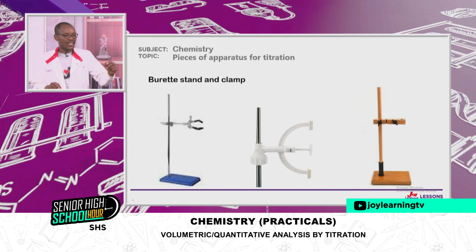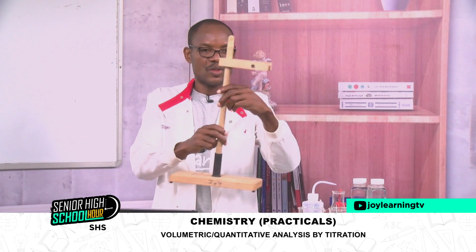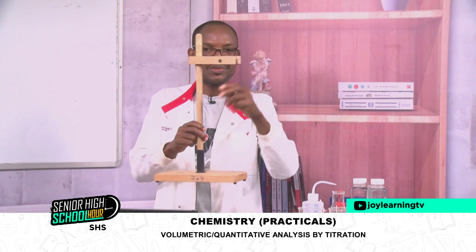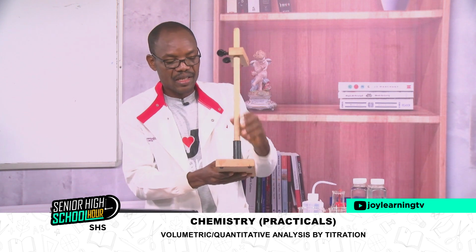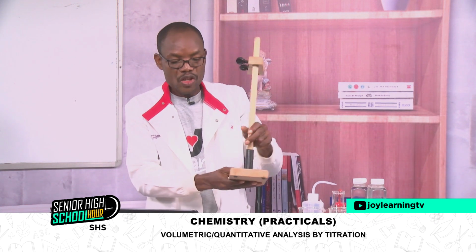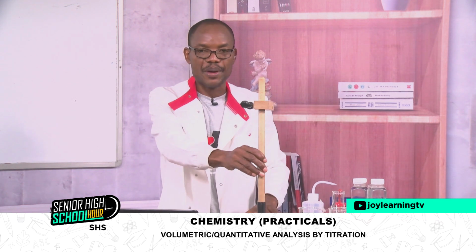The next thing is the burette stand. So it has a clamp and it has a base. The base is heavier and broader so that when you place it down, it doesn't topple over, it will stand firm.